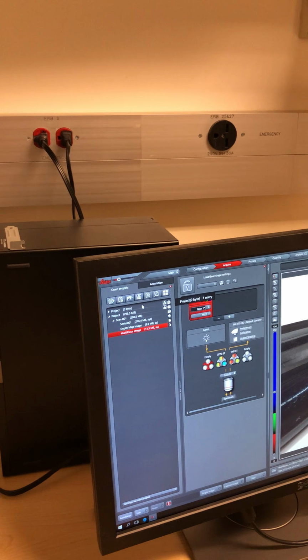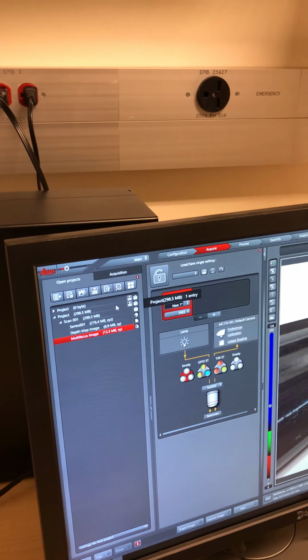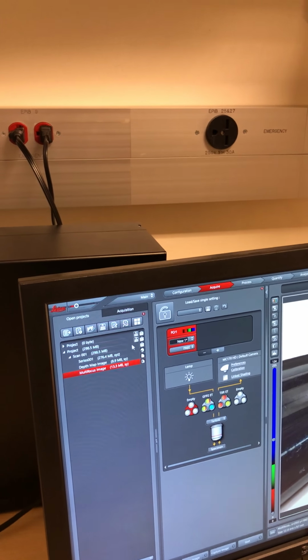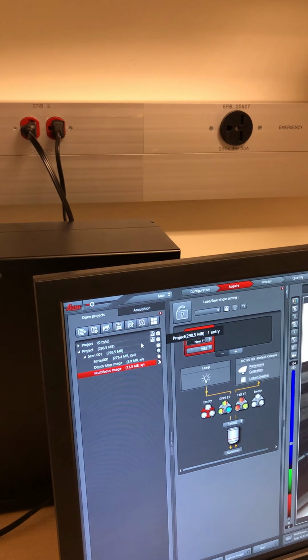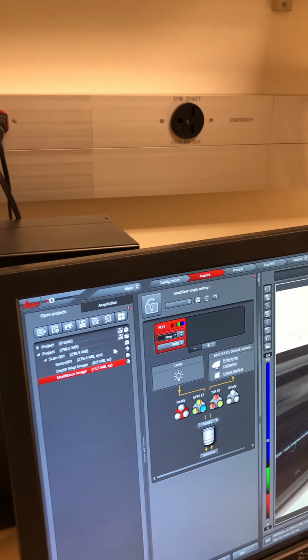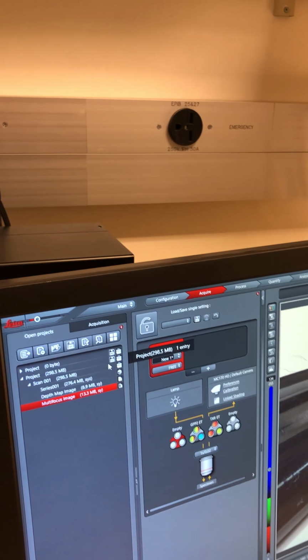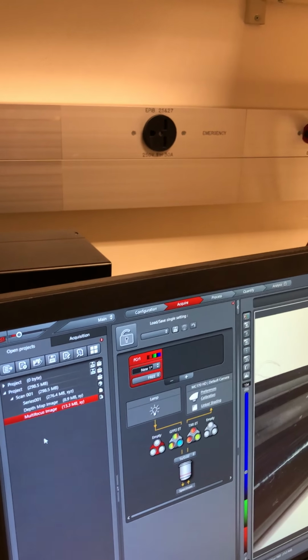Okay, got it. So what happens if you close this program without doing that, or we get a power surge? It'll be in that temp folder, so you can find it. Does it autosave? It autosaves when you acquire, into the temp folder. It'll move that into your personal folder, wherever you choose to save it, when you click save.